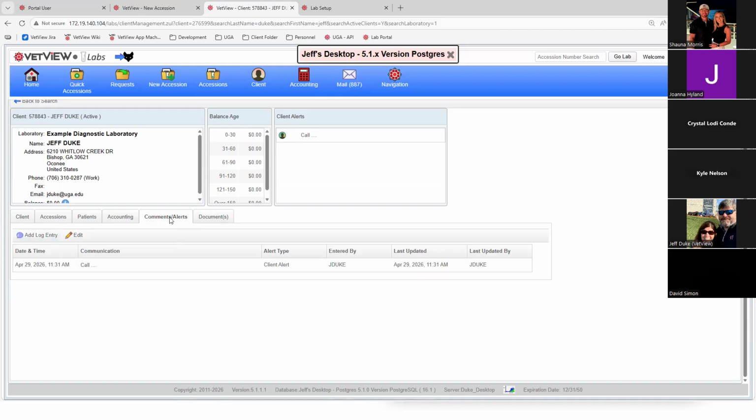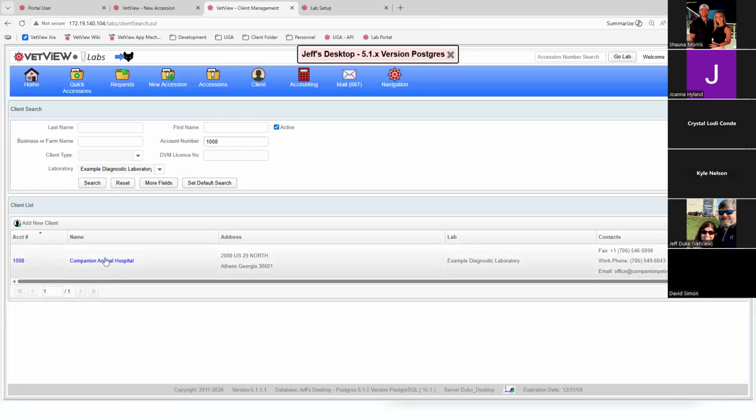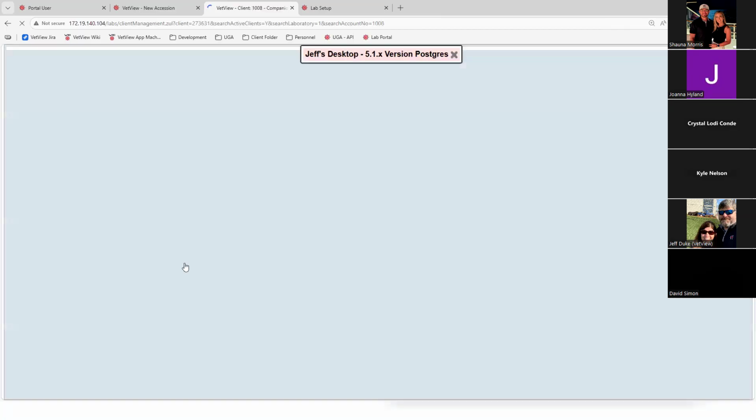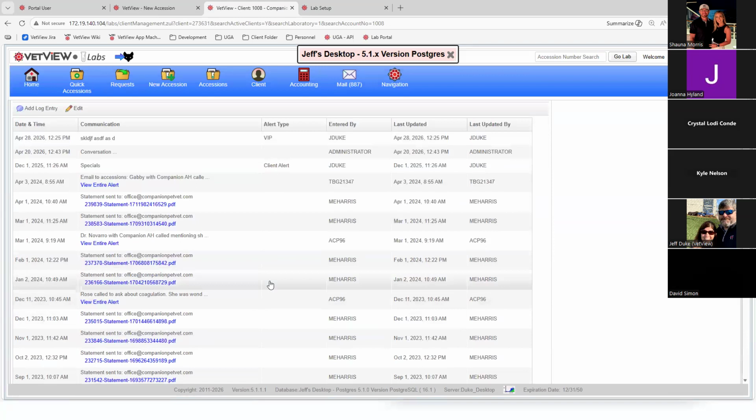So again, if you're getting phone calls from people asking about reports or asking about things, let me pull up another account and show you an example of this. What you'll see in the log here is it's pretty verbose in the sense that it shows you when and where it went.